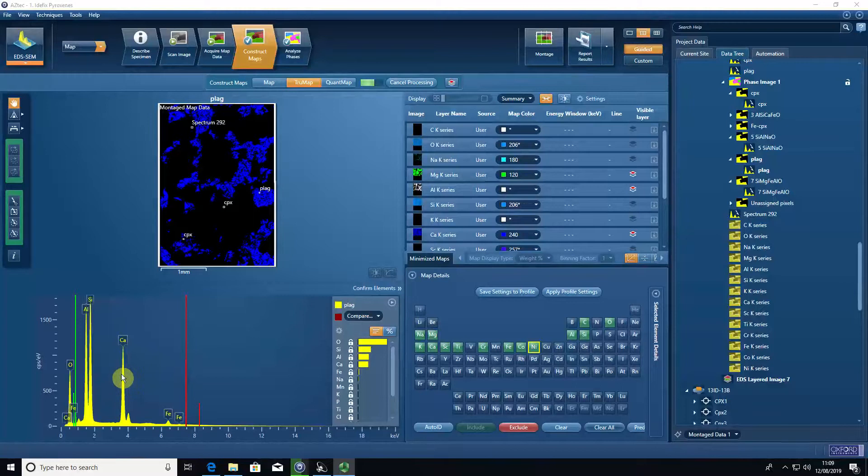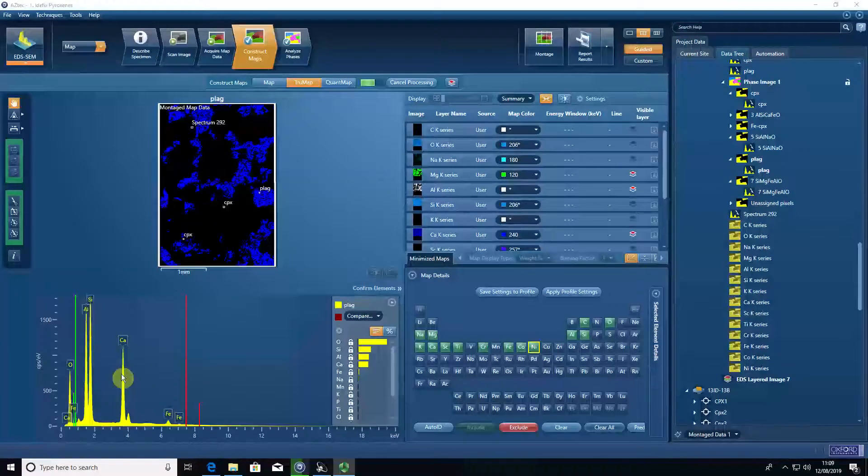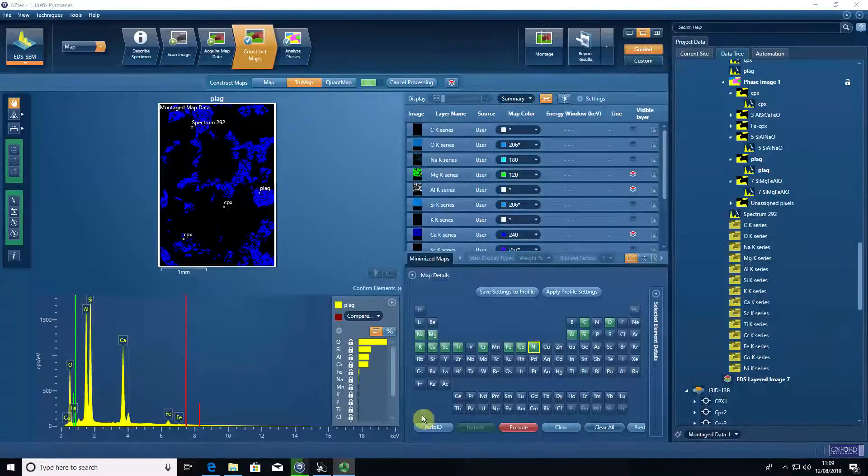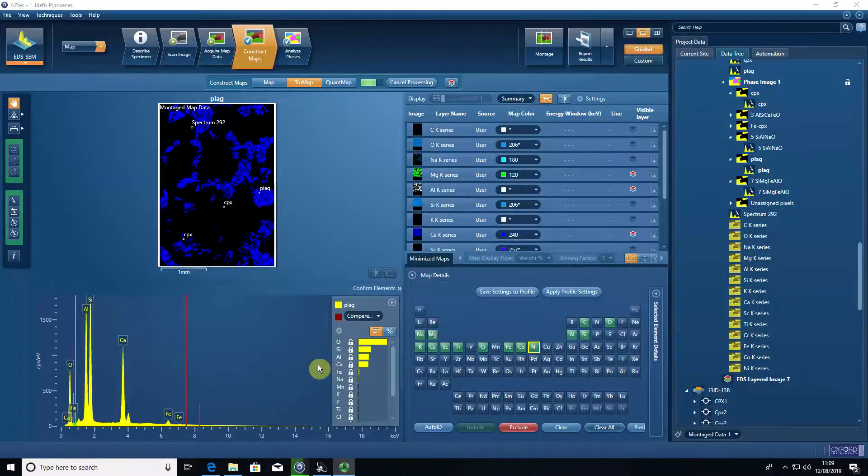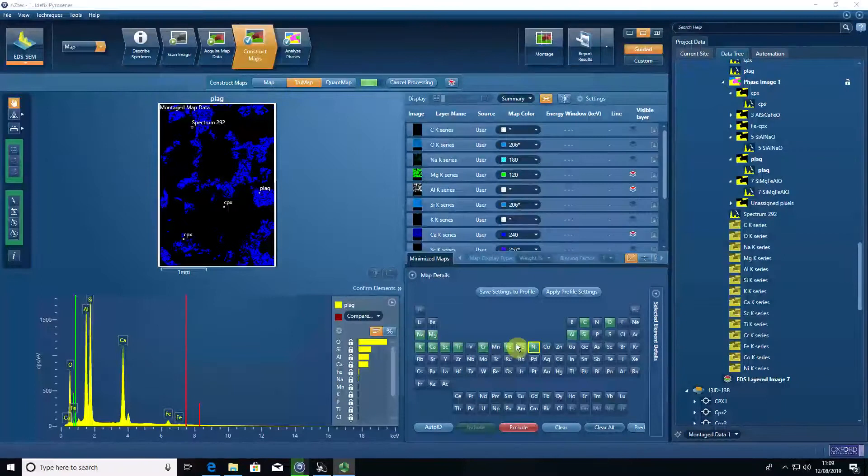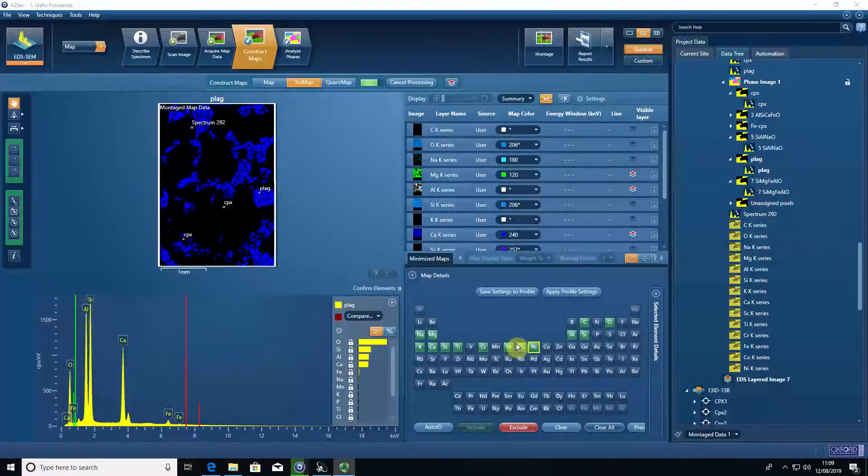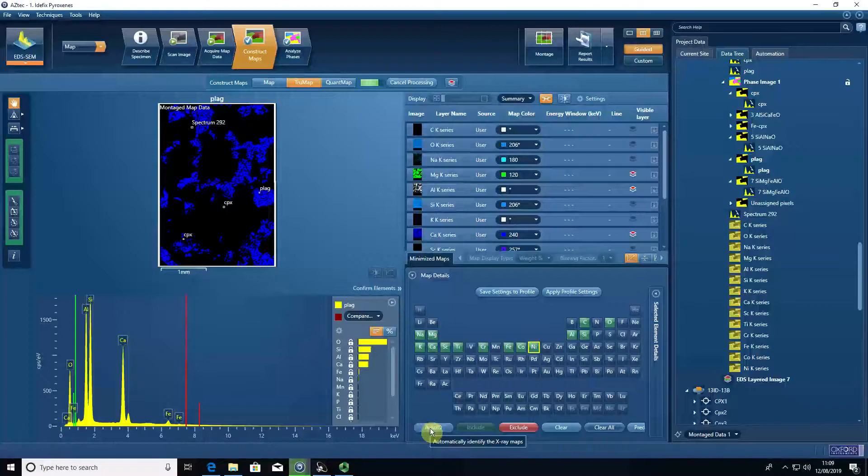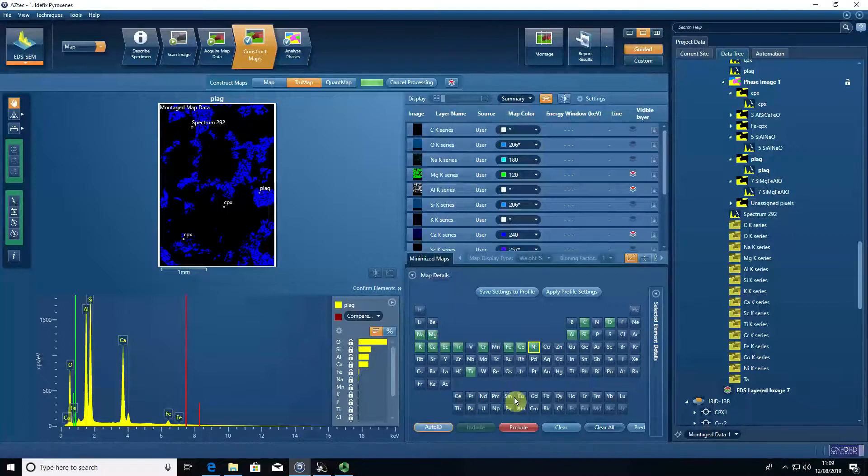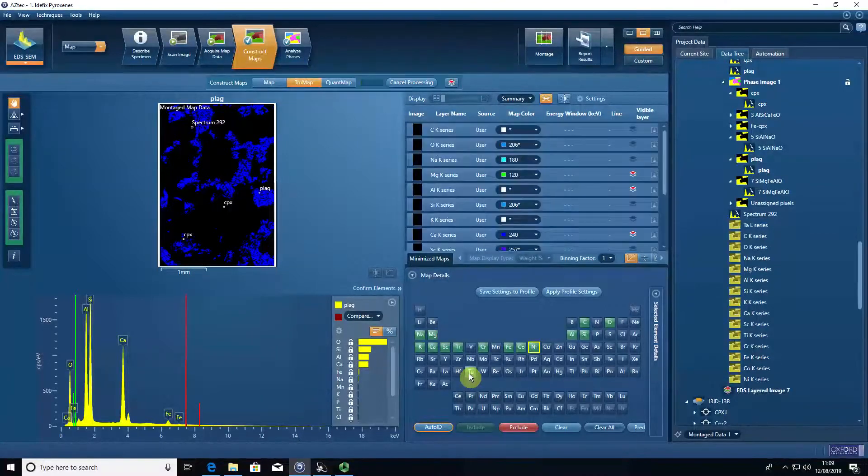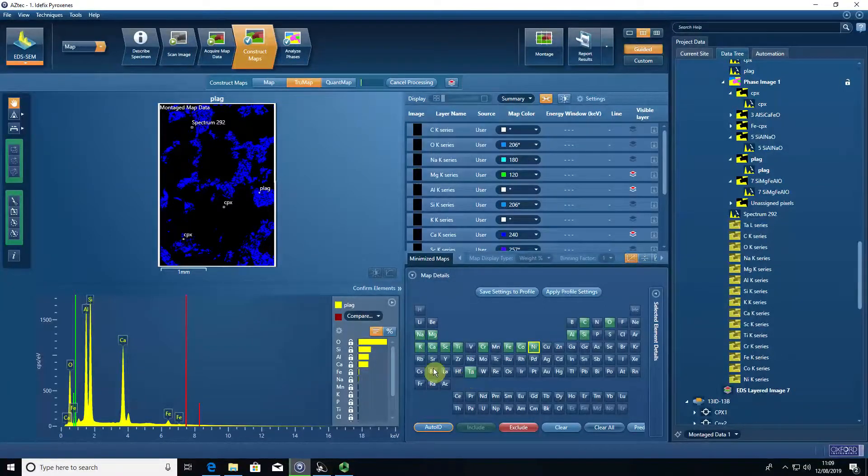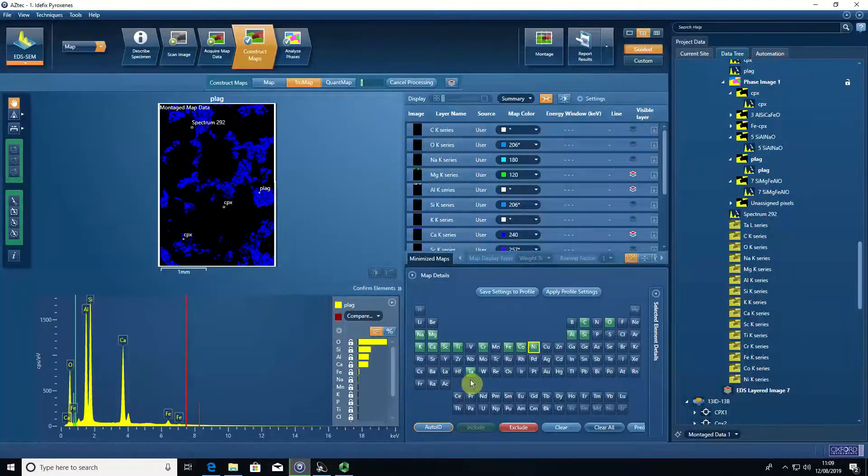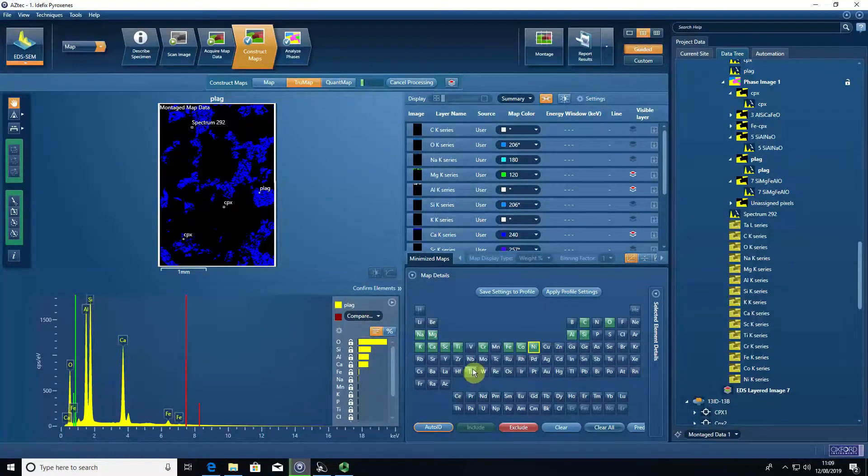I find it most useful to select a predefined list of elements before I true map my data. If I auto ID, just to show an example, I can end up with elements that geologically speaking for this type of sample, which is a peroxinite, I would not be expecting.